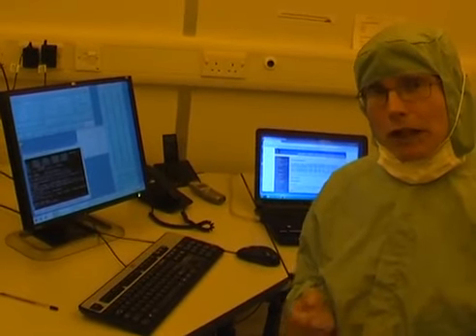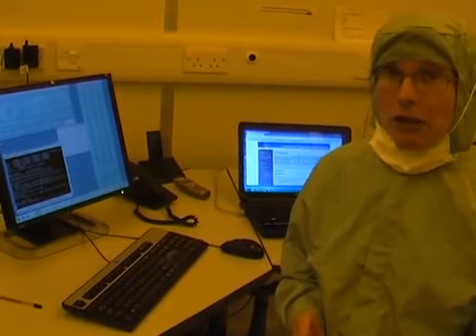Secondly, when you're preparing your sample, make sure that it's clean underneath. Any resist at the back of the sample means it doesn't sit flat, and the operator has to spend more time trying to get it flat or may send it back to you for you to clean up yourself.